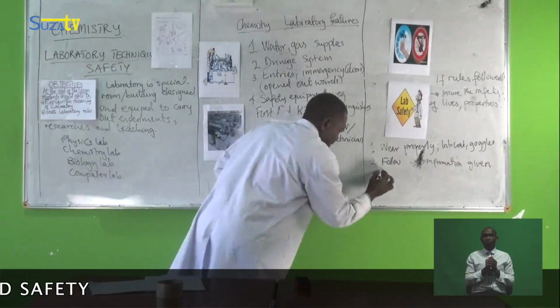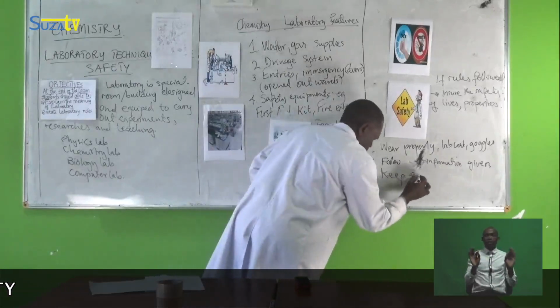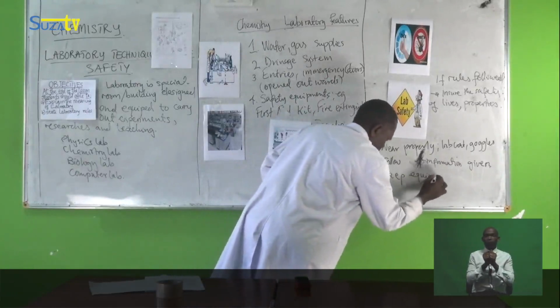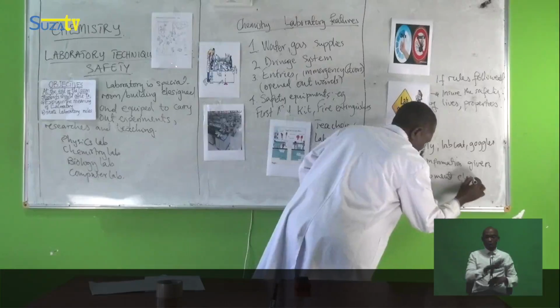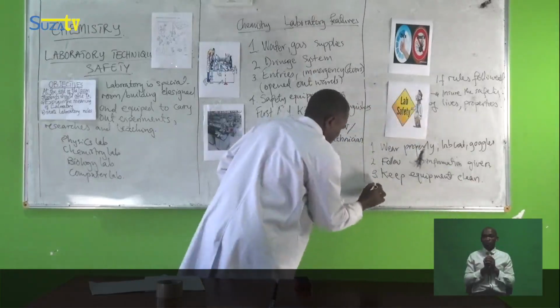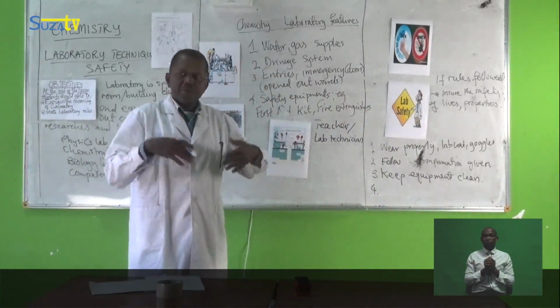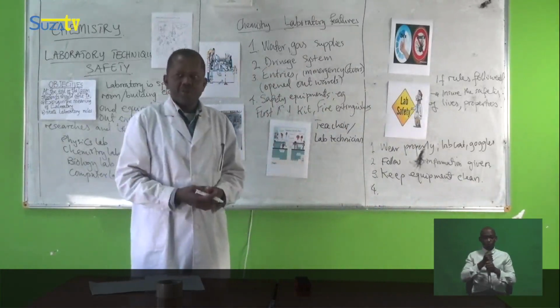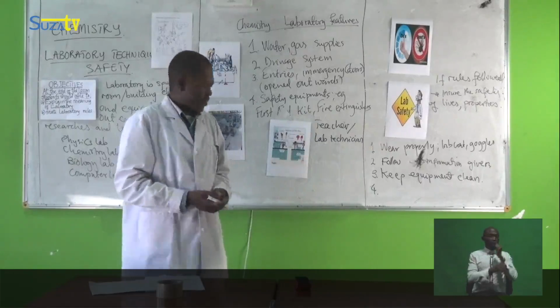Keep everything clean. Equipment or laboratory environment clean. Also, don't do an experiment or anything without permission or being informed.